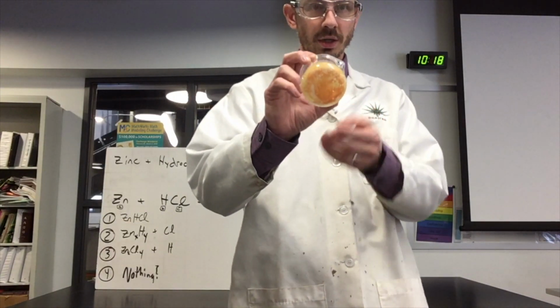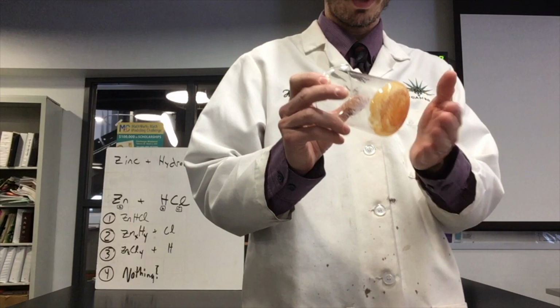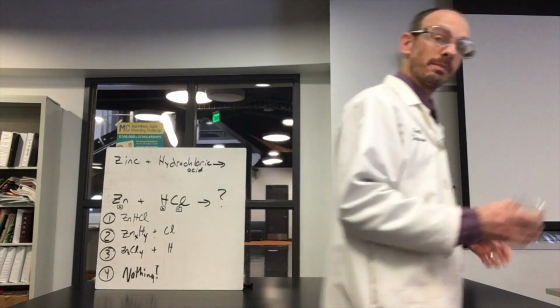So just to show you, this material is now completely dried inside of there. There's no evidence of liquid. It's cool to the touch, which means that it is ready to mass.